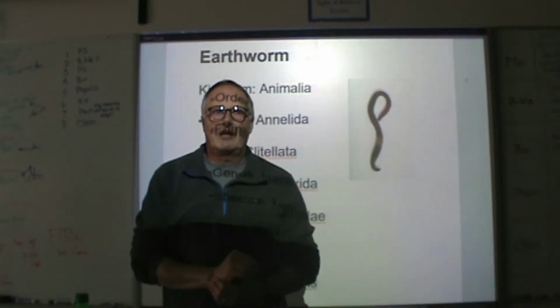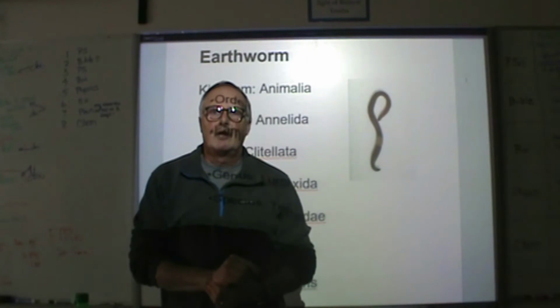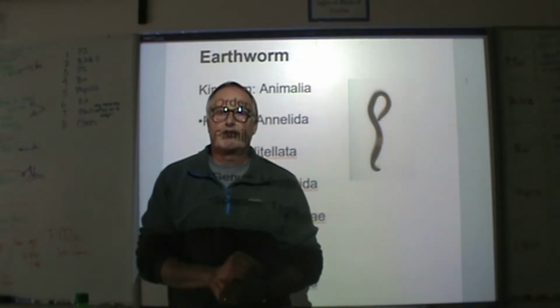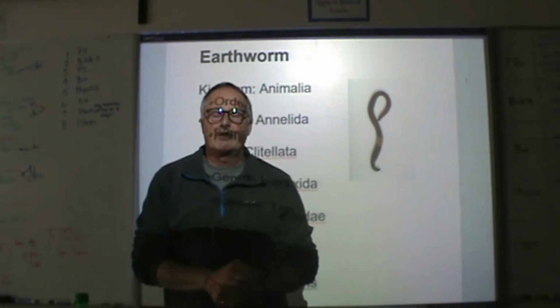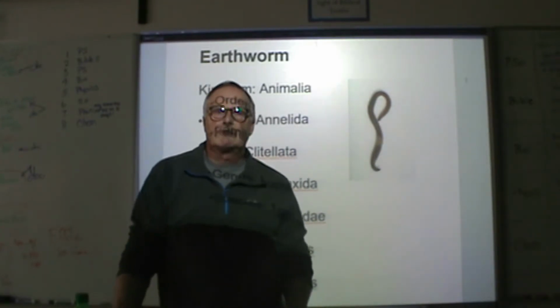They can be about the size of a normal earthworm you just dig up, but they have a different environment that they're used to, and they aren't out there supporting themselves, and you'll see the difference when an animal has to provide food for itself and when it's actually going to have the food delivered to it, and what's the difference in the structure and how God put them together.